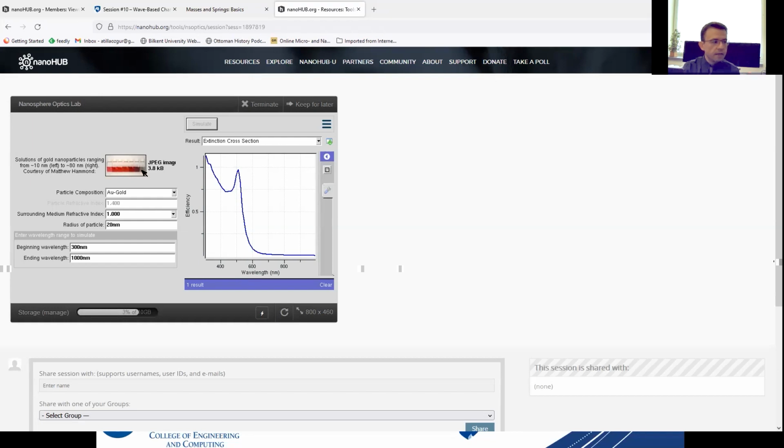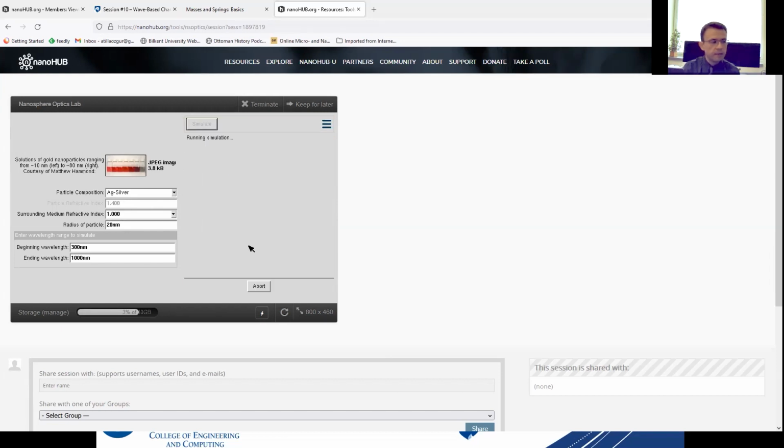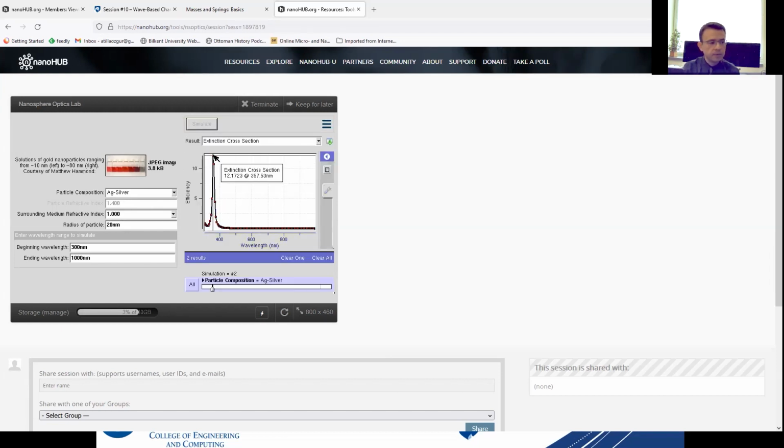here. These nanoparticles absorb the green color, okay? You can see the peak occurring here, and they also absorb highly the blue color. What is left is the red colors. It's not touched, so that's why they become red. And you can do it for, say, silver, simulate it, and see that silver will absorb a completely different color, and that's the main difference why, thanks to the UV-Vis, we get a different color from the silver nanoparticles.